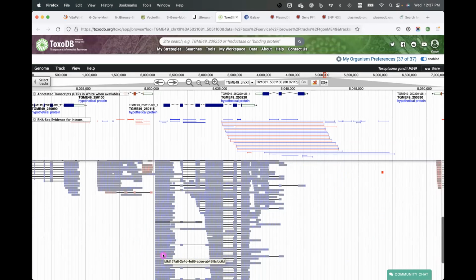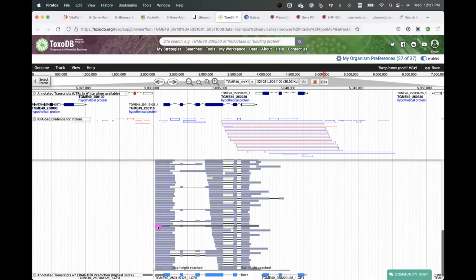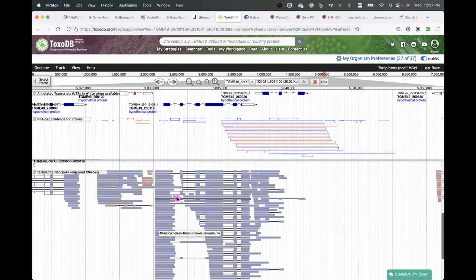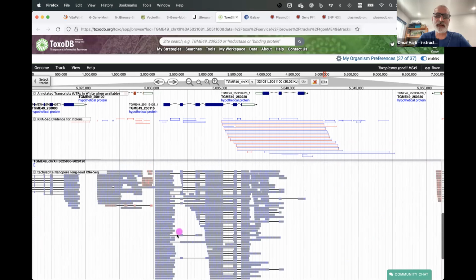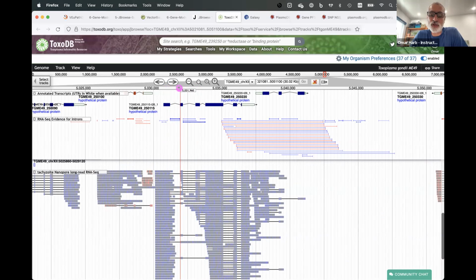Yep, those that you're looking at right there. Some of them don't have that line cutting across, which I think means that the alignment split them into the gene, right? Correct. I was wondering if all of those that are really neatly aligned would mean that that is a separate transcript altogether.